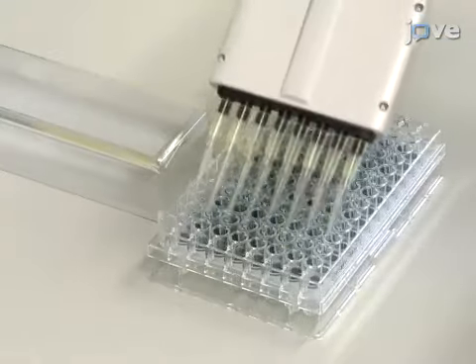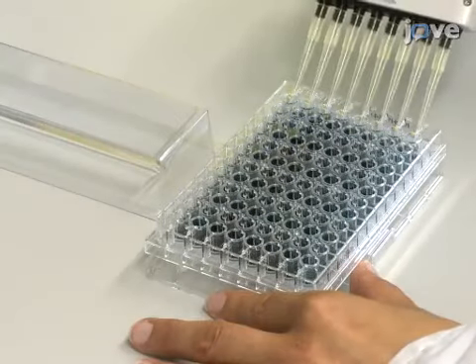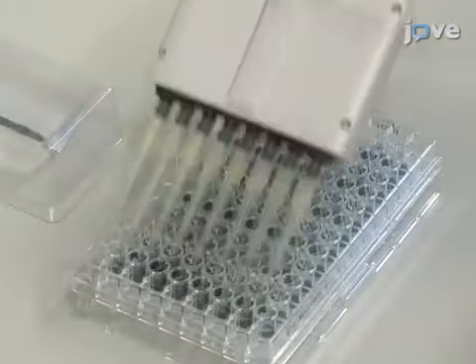Add 100 microliters of sterile water to the chromogenic polymer hydrogel, or CPH, substrates, and apply a vacuum or spin to remove the stabilizer. Repeat the wash two more times.